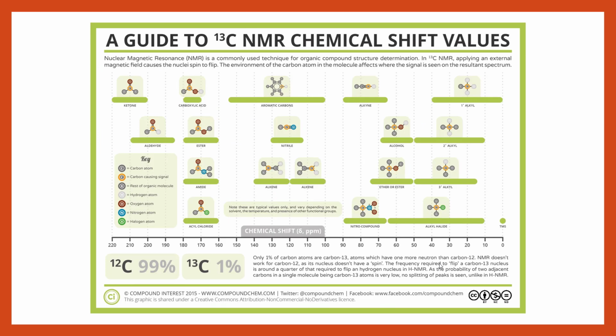And again, the same trends follow, okay? So we still have similar chemical shift values. We still have our alkyl region. We still have our alkyl regions that now have more electronegative groups bound to them, so oxygens, nitrogens, double and triple bonds. We then have our aromatic area, and again, we might get some NH groups popping up here too.